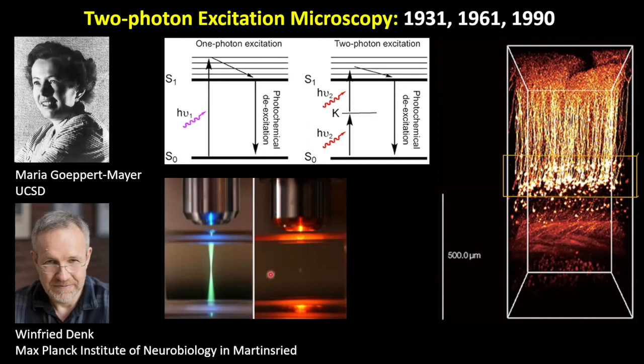So for example, in this picture, you can see for single photon, here's the light focus, but beyond and below the focus there is also extra light. That light can make the image much more blurry as it goes to the detector, and also causes more photodamage to the samples. However, for two-photon or multi-photon, you can see the light only focuses on this spot here. I'm not sure you can see it, it's a very tiny spot. So therefore, they achieved optical sectioning by this two-photon excitation.